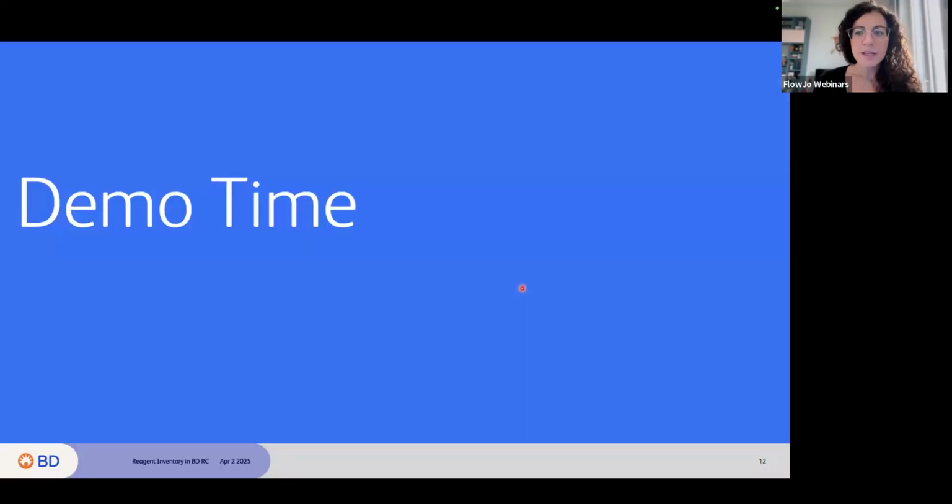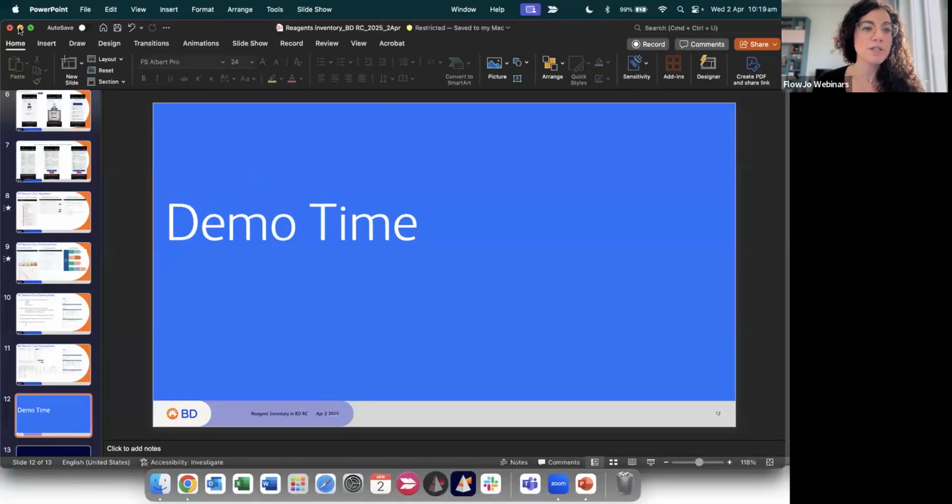So let's jump right into that. It's demo time. This was just an introduction. And again, if you do have any question, please ask. I'll be happy to answer your questions.